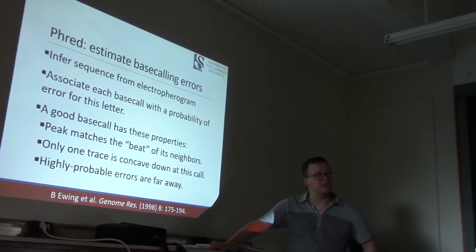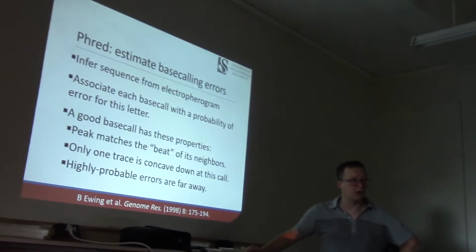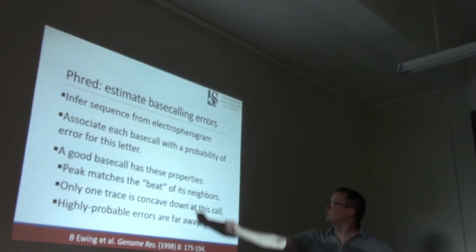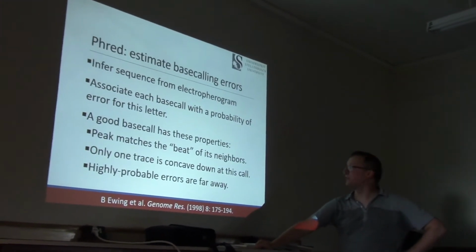Phred is going to associate with each base call, with each letter, our probability of error for that letter. So how do we discern a good base call from a bad? There are several things that come into play here.